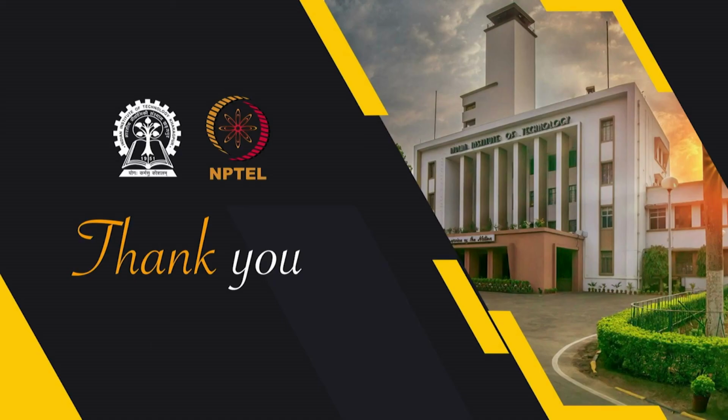Now, one of the things that we have not discussed is how we process this HDF5 data. We will talk about that in the data analysis part. For FASTQ we can read them quite easily. You can open with an editor and read one read after another. FAST5 we have not discussed, and we can discuss later on how we process this HDF5 of FAST5. Okay. With that I will close.